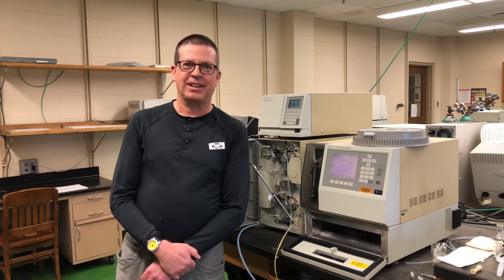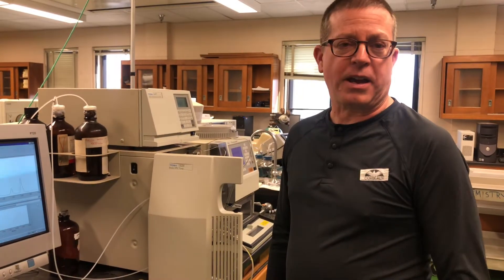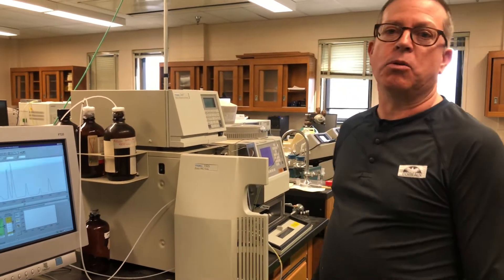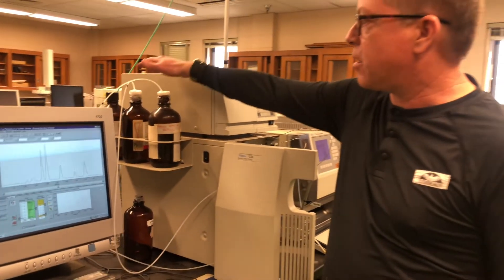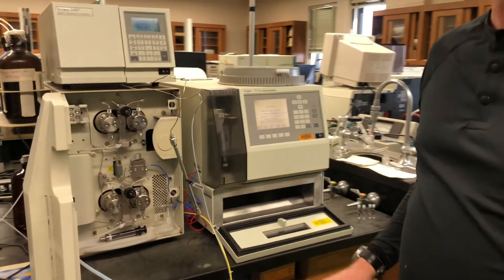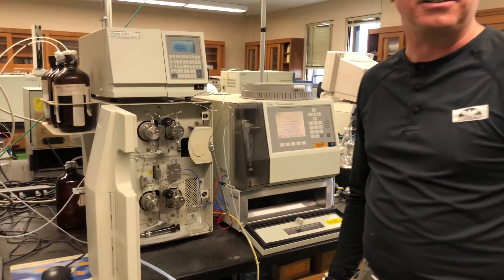Welcome to the lab, folks. What we wanted to do here was to show you one of the actual HPLC instruments that we use here at Cultured Analysis. Let's start by showing you some of the different parts of the instrument that we introduced earlier in today's video. Remember we need the liquid mobile phase, so what we actually have here are a series of solvent reservoirs that we can use to store those mobile phases. From there, we have tubes that run over to our pumping system. This instrument has two sets of pumps — an A pump and a B pump — so we can push two different mobile phases either together or separately in time.